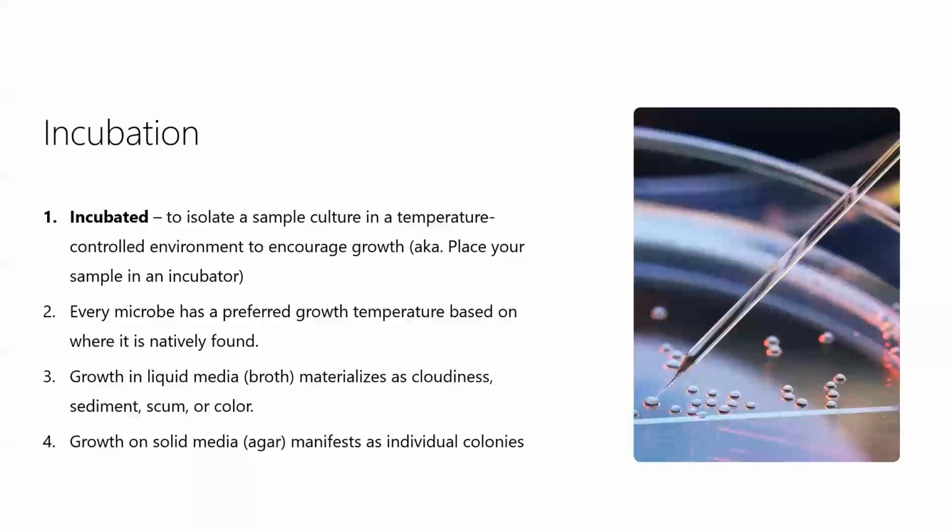When you inoculate it and let it incubate for some time, you'll start to see cloudiness. So it will become more turbid. You won't be able to see through it as clearly. Sometimes you'll see clumps in the bottom or sediment where a lot of the bacteria have grown up and sunk to the bottom. Sometimes you'll see scum, or it will float more. Okay, so you'll see evidence there. Sometimes, if you have a mold or something like that, it'll grow on top. And occasionally you'll see a color change as well. All of these would be evidence that while I can't see the individual microbes, I do see that they're growing and multiplying.